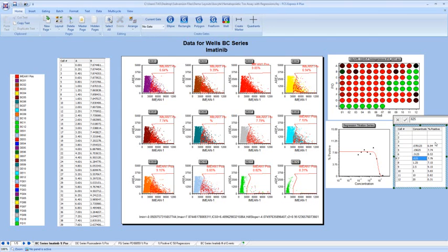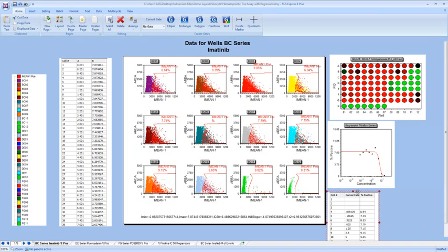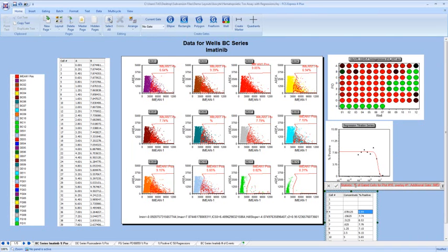But we have the % positive token being displayed here, and let me bring this somewhere else on the screen so you can see it a little better. But this % positive token actually relates back to the plot, and you can see here that this is 6.94%, and that's where this token is being displayed.